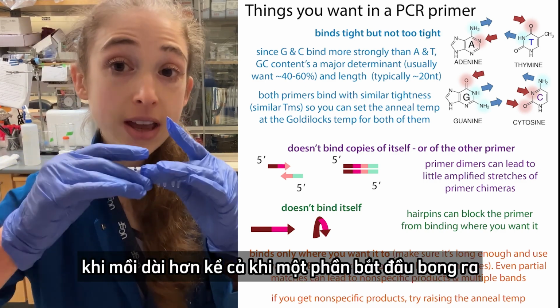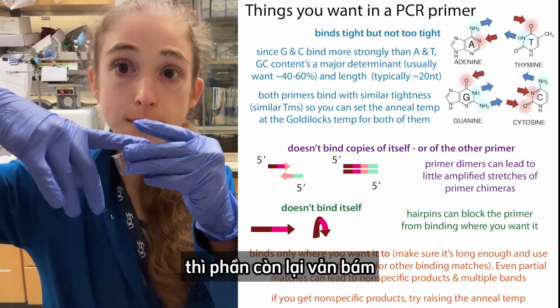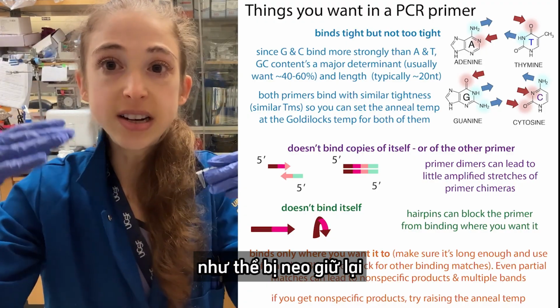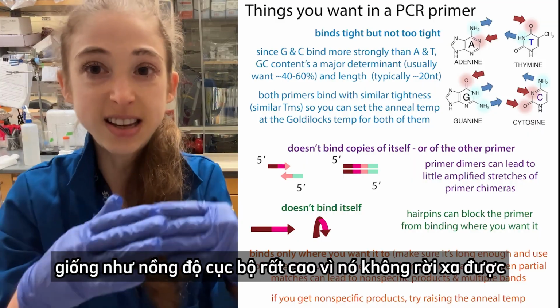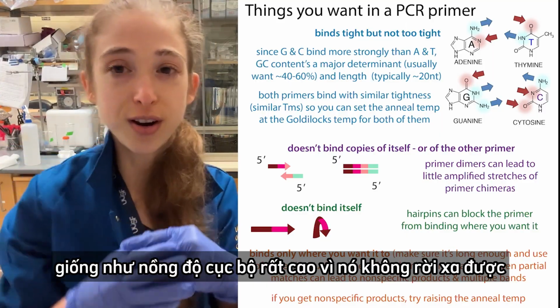Now, if you have a longer sequence, even if part of it starts to come off, you still have all this still stuck there, and you basically get this avidity effect where it's anchored down, and so it can't go too far without getting pulled back in. It's like it has a really high local concentration because it can't go too far away.